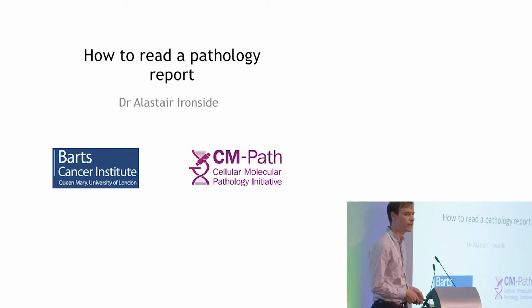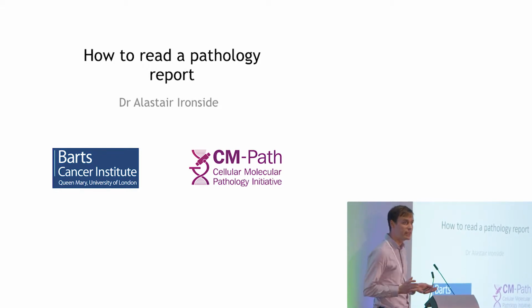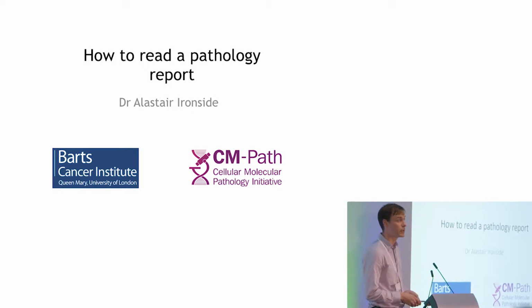And I hope that in the next 15 minutes or so I'll be able to demystify a little bit some of the terminology that you find on a melanoma pathology report, and also just give you a little insight into what actually happens to tissue biopsy samples taken for melanoma diagnosis.